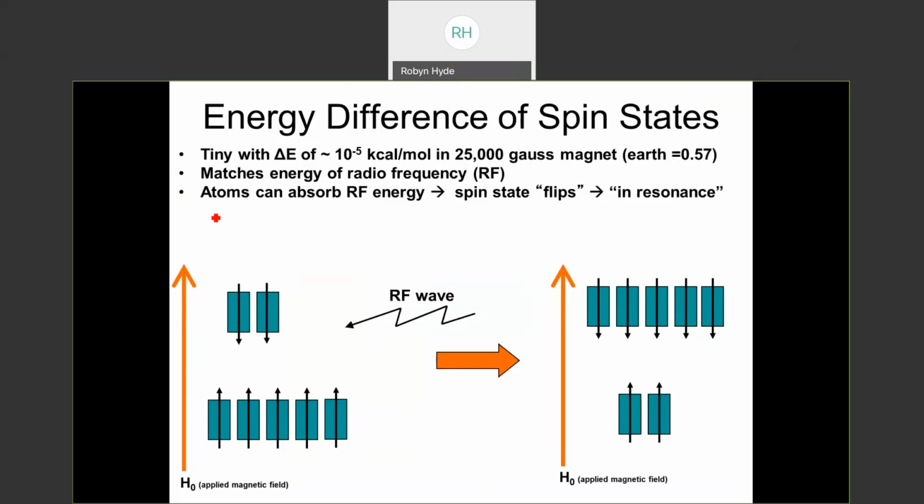So that's the fundamentals. Some of you may have been inside an NMR. You just didn't know it. The other name for NMR, the human version of NMR, is known as MRI, magnetic resonance imaging. We lay our bodies on a table, and I've actually never had an MRI. I just watched lots of movies with MRIs. Then the bodies go into a really big magnet, which is why you can't be wearing anything metal.